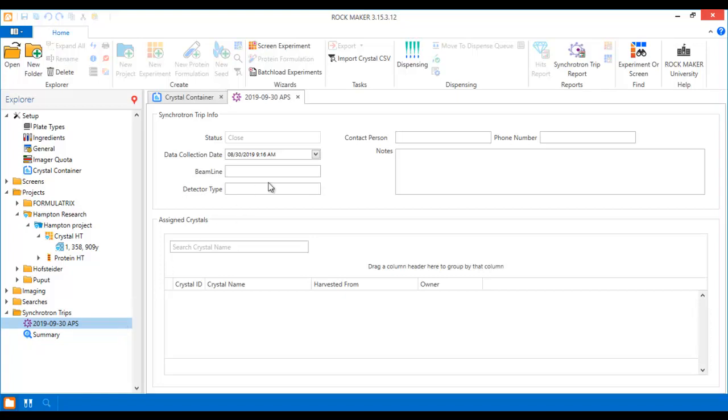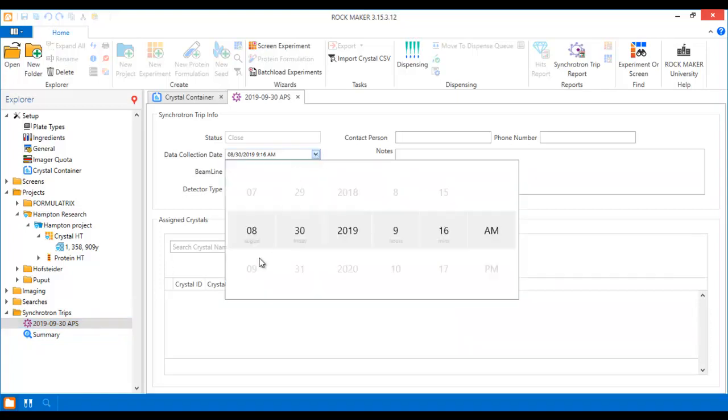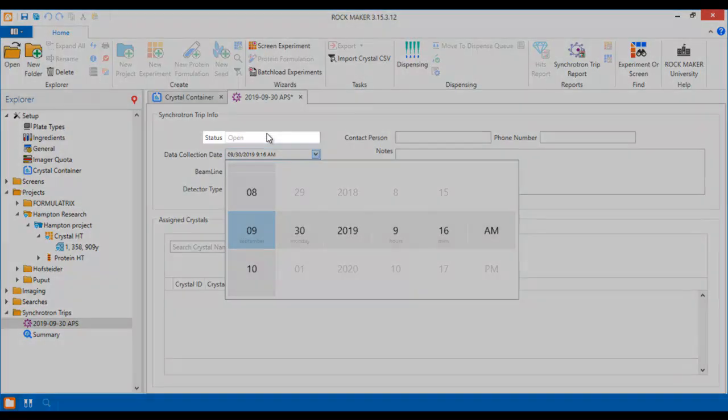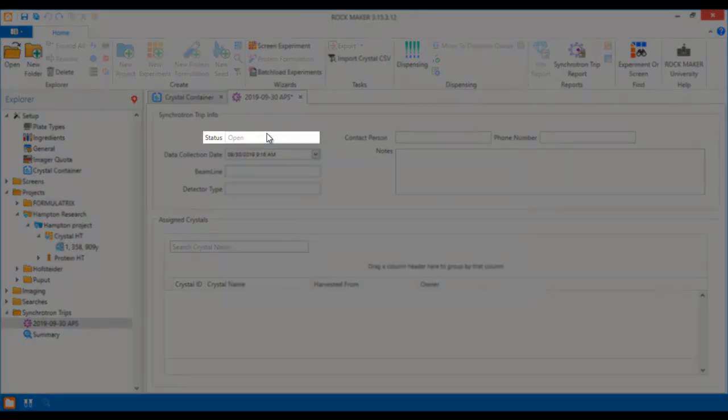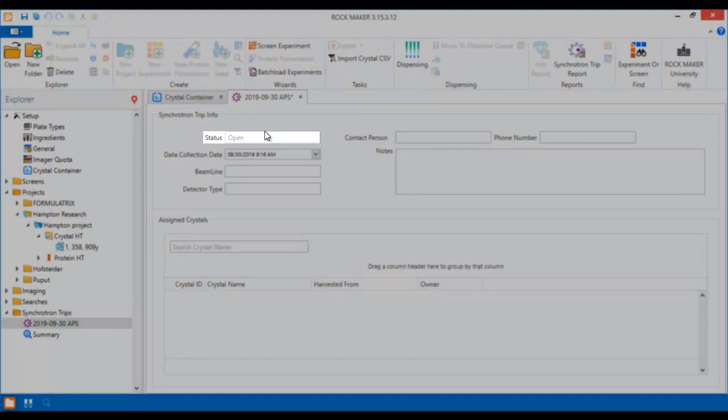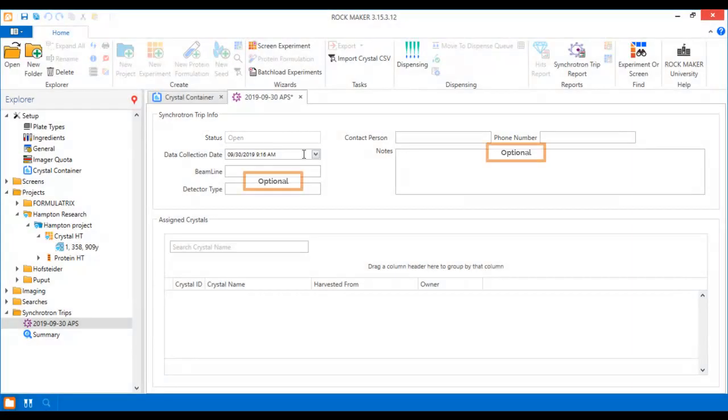Then select the data collection date for your synchrotron trip. The status field will change to open if the chosen date is in the future. The rest of the fields are optional, but you can use them to add some more detailed information about your trip if you like.